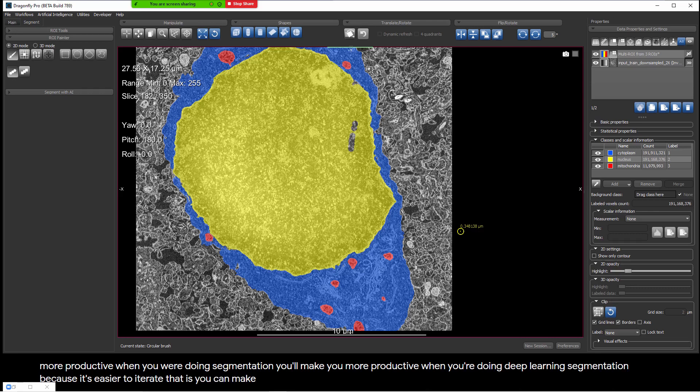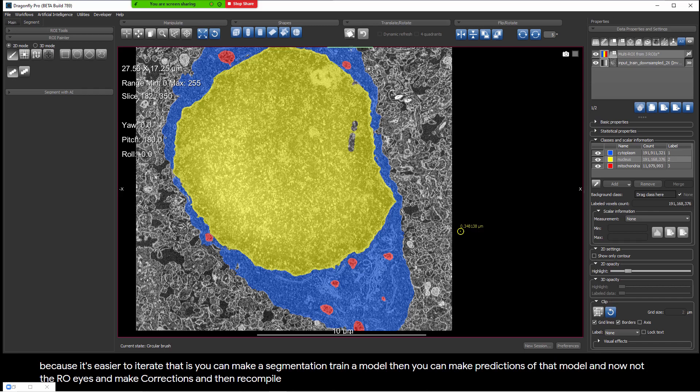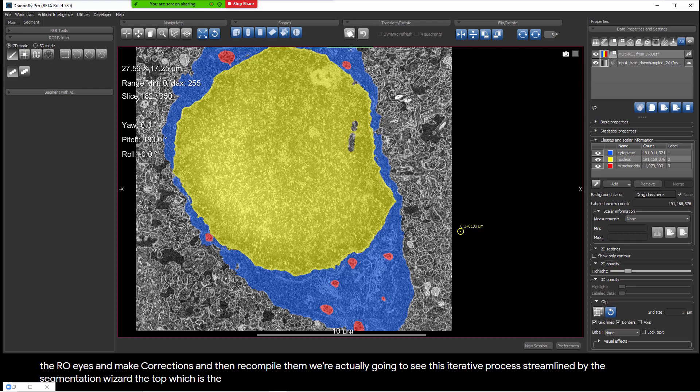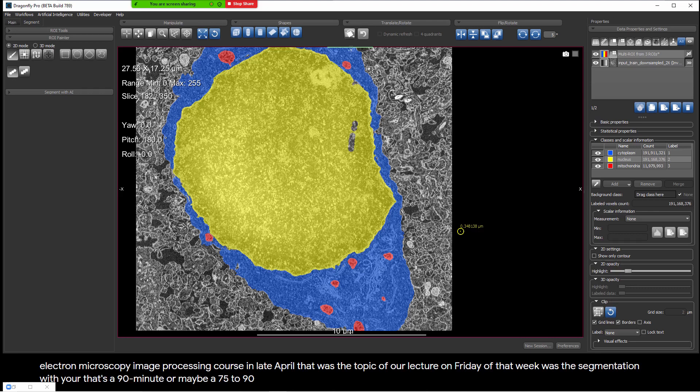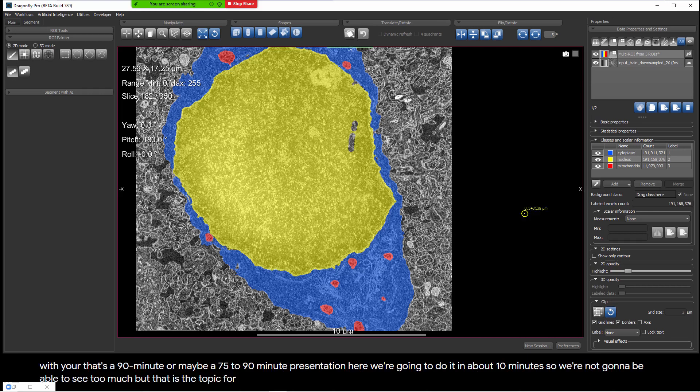These changes will make you more productive when doing segmentation and deep learning segmentation, because it's easier to iterate. You can make a segmentation, train a model, make predictions with that model, and now edit them directly rather than extracting ROIs, making corrections, and recompiling them. We're going to see this iterative process streamlined by the Segmentation Wizard, which is the main topic for today. If you caught the CCEM lectures from the McMaster electron microscopy image processing course in late April, the segmentation wizard was the topic of our Friday lecture — a 90-minute presentation. Here we'll do it in about 10 minutes.